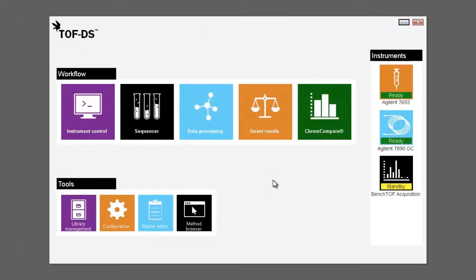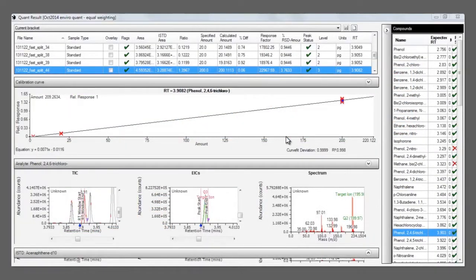Once a quant method has been applied to your samples, either in real-time or through a post-analysis batch process, the calibration results can be viewed in the quant results module of TOFDS.